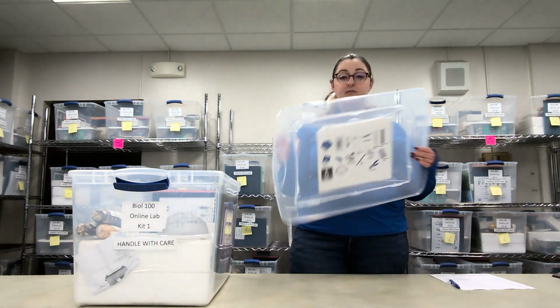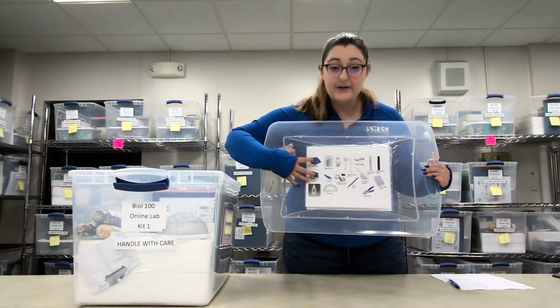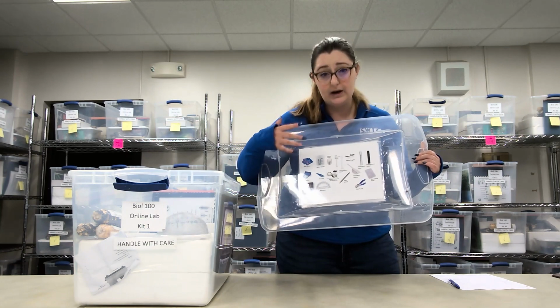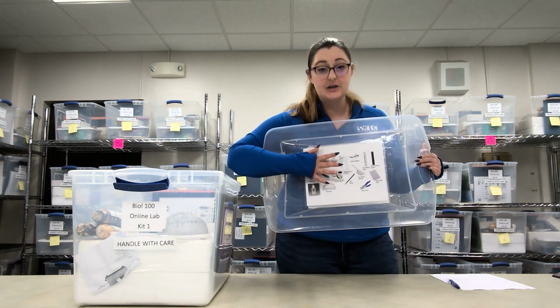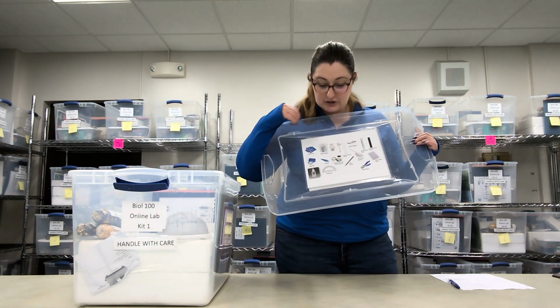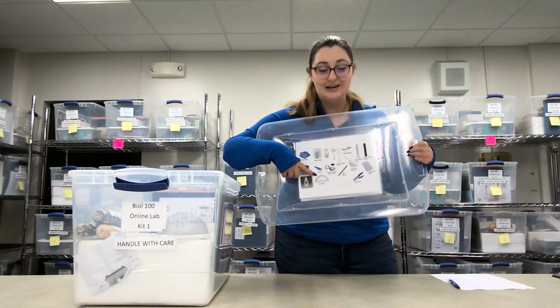On top of the lid, on the inside, you're going to see there is an index with pictures of items that maybe you weren't sure what it was. So in case you get confused while you're taking the class, you can always reference this index. So if you were not sure what a protractor was, well, it's right here. There's a picture, shows you what it is.